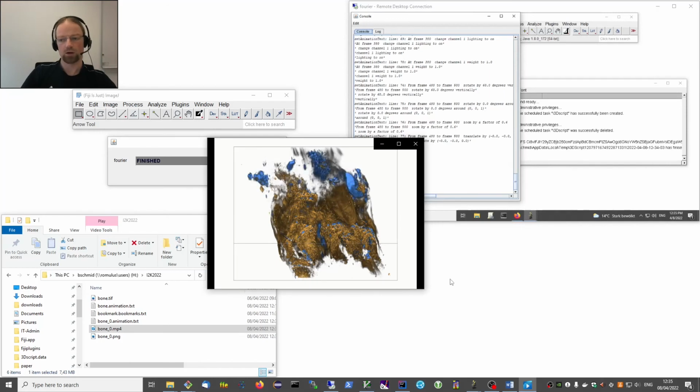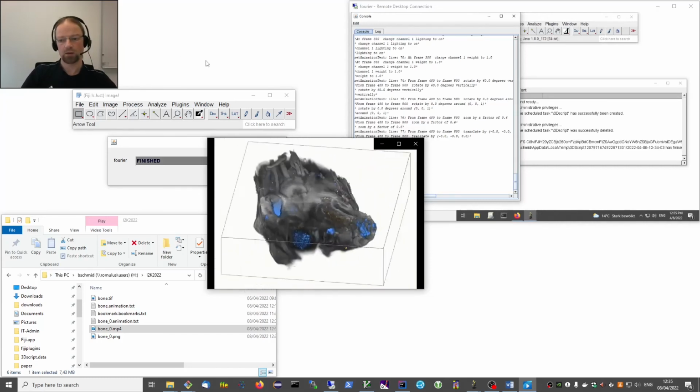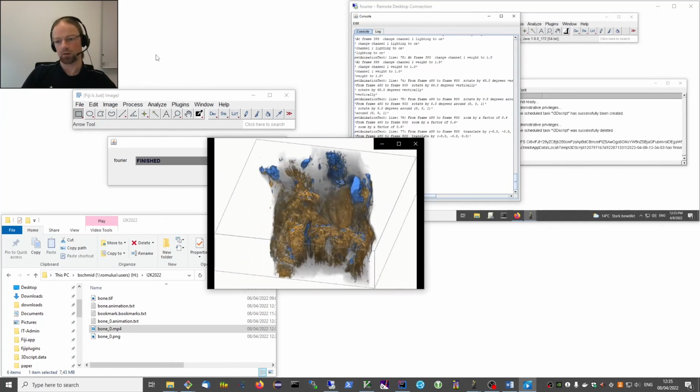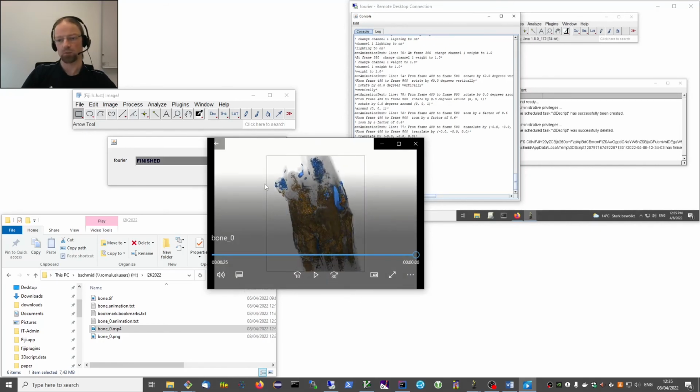So all the hard work was now done on this remote server, and I could have done this basically in a cafe using my laptop. It does not really need a lot of data transfer. The biggest part is probably the resulting video which I downloaded now.